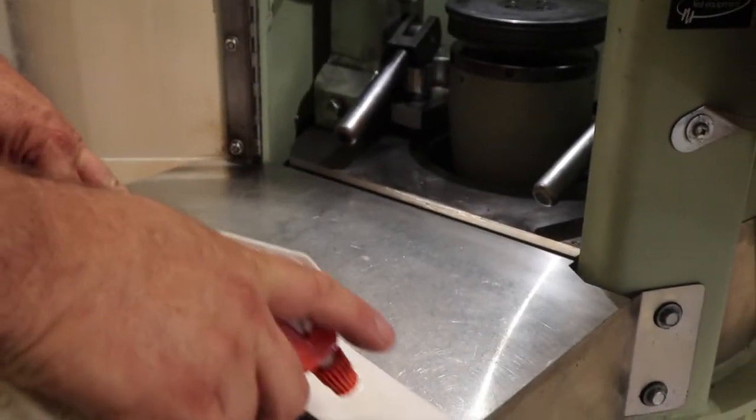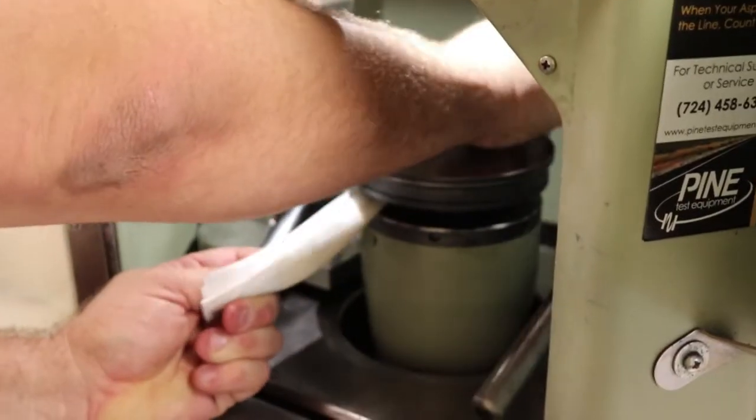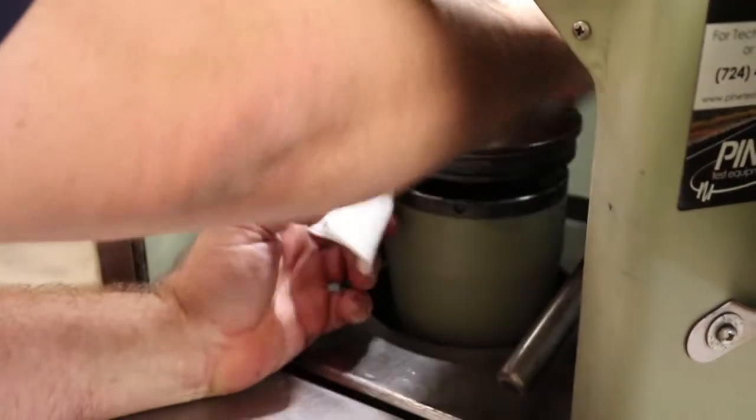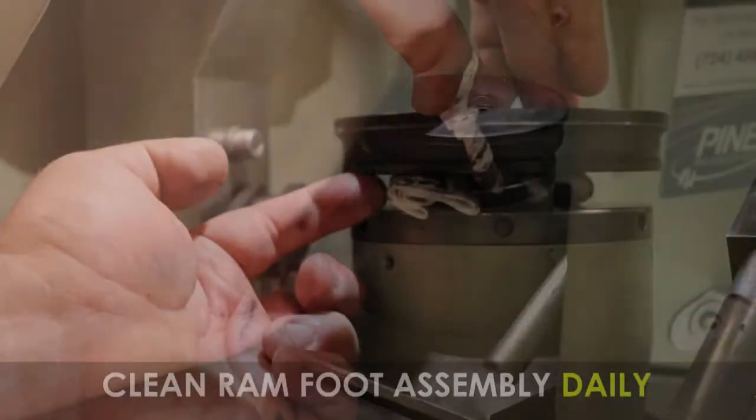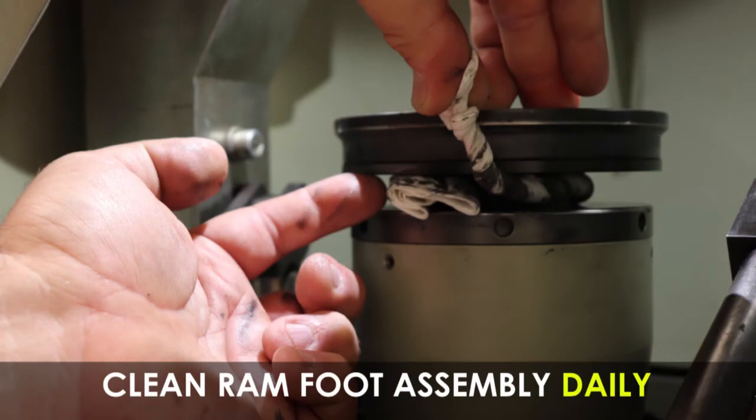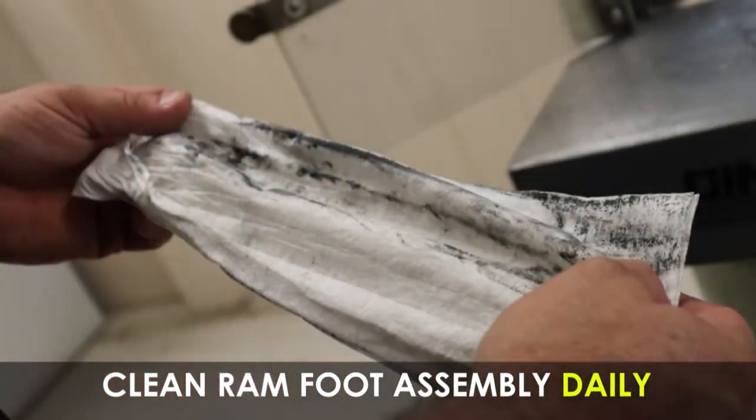Spray a clean rag with degreaser and twirl it around the gap of the RAM foot assembly to remove the old anti-seize. This step usually needs repeated several times until the rags are relatively clean.